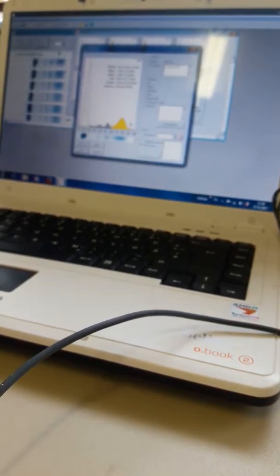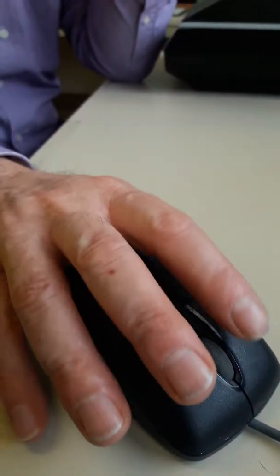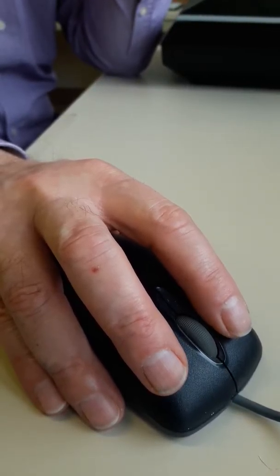To remove a minimum marking, place the cursor cross above the minimum marking you want to delete and make a double click with the left mouse button and it will disappear. And how you do so? With the double click with the left. You see, double click.